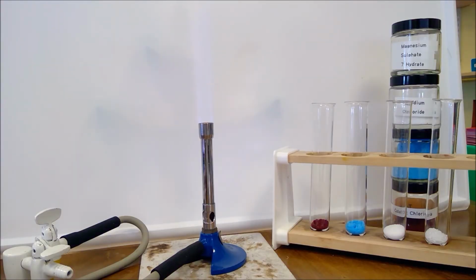Here we're looking at the effect of heat on crystals. So we're going to heat our samples and observe any changes. We're going to see if we can observe any condensation, and then we're also going to add some water to our samples at the end and see if we can see any further changes there.